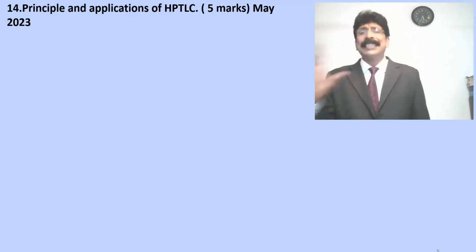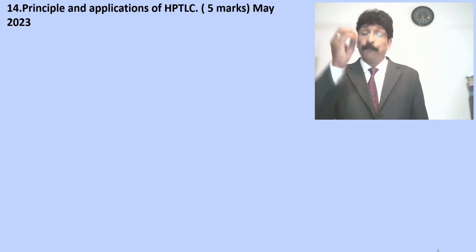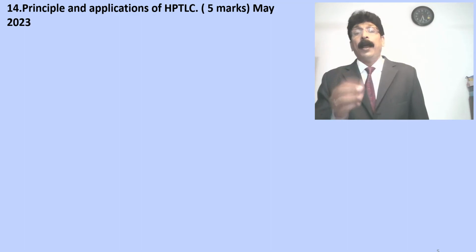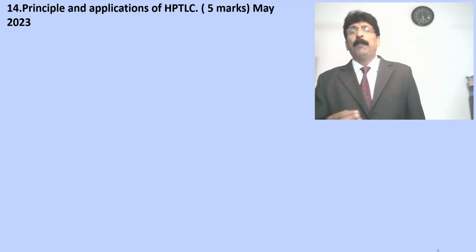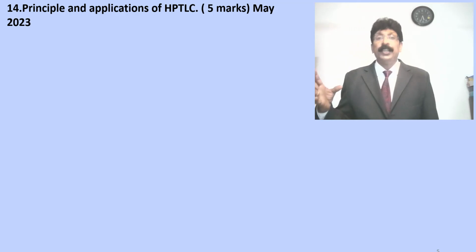These can be used even for formulated substances, fresh crude drugs and generic compounds, which can also be identified by means of HPTLC.